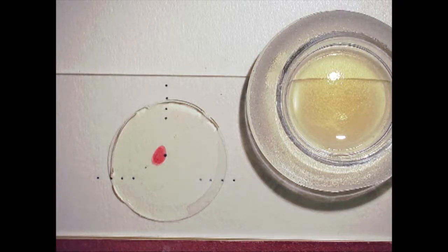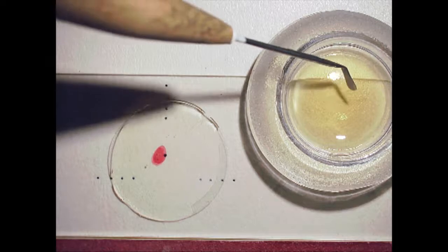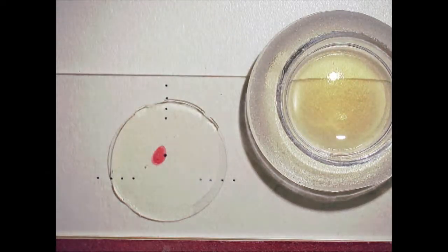After you're finished with your slide, you'll want to place that on a tray, and you'll want to put that in a drying oven. In this case, I probably didn't put quite enough balsam in, and what I do is I get a little bit of clove oil just on the spatula, and that will break the surface tension of the balsam and allow it to move nicely. Went right around the edge of that cover slip. Another trick, in addition to the clove oil, is also to take that microscope slide and place it on the warming tray or on a hot plate, just briefly, and that'll allow the balsam to move under the cover slip. And there you have it.